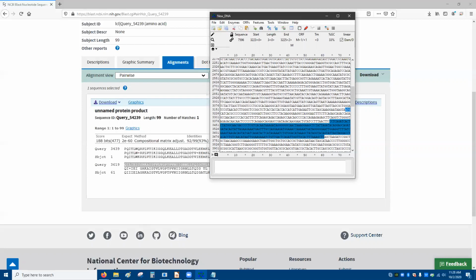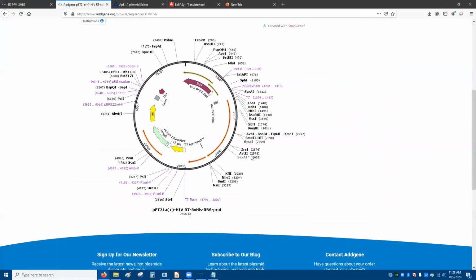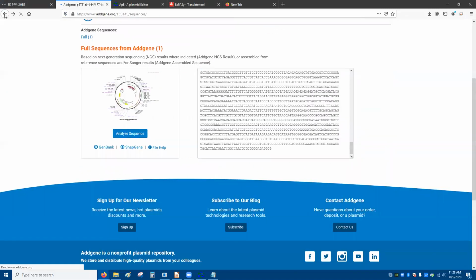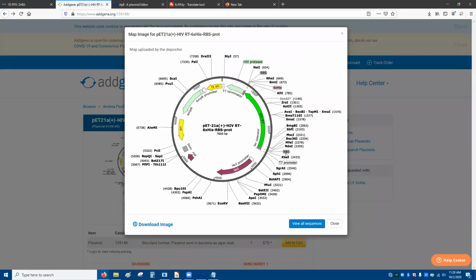If we look at the map of the enzyme of this one, I don't like this one. The other, there you go. So if you look here, ribosome binding site, so there's 2 binding sites here. So if we wanted to get rid of this and just use this vector, we can do that, but then we have to find a cutting site here and match it up with something down here. So right now we might do a case with NdeI. Let's see how that goes.